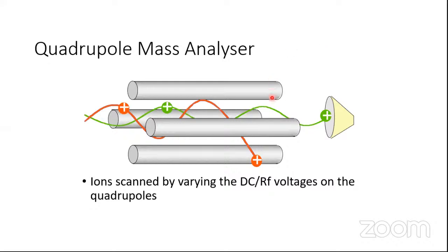Okay, so we have a DC RF voltage which will control the movement of ions, and we scan this voltage continuously so that one by one the ions go to the detector, and all the ions of different m/z will be measured by the detector as they come out from the ionization source and get into the mass analyzer. This scanning is so fast that it scans at the rate of something like 20,000 Daltons per second. So in 1 second, we can scan compounds from 0 to 20,000 molecular weight. If I have ions from mass 1 to 20,000, all of them will be scanned in just 1 second. So you can imagine the scanning speed.